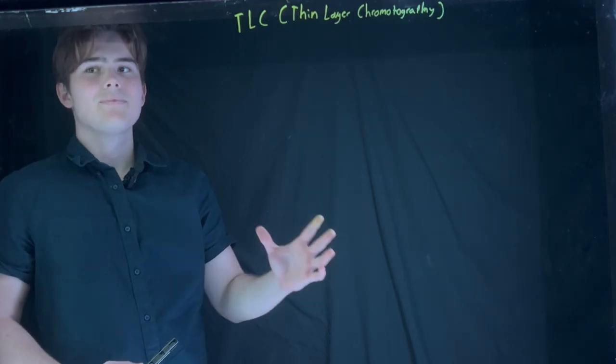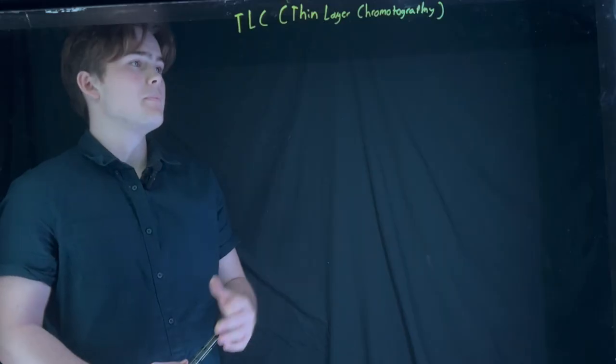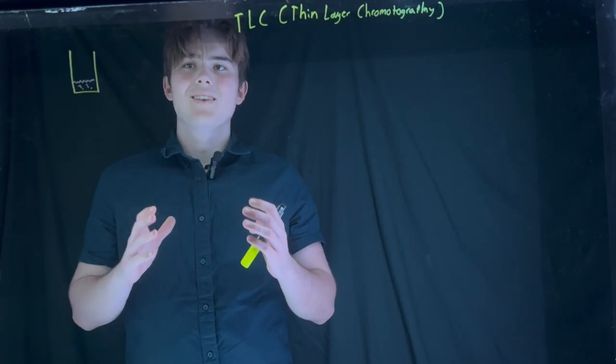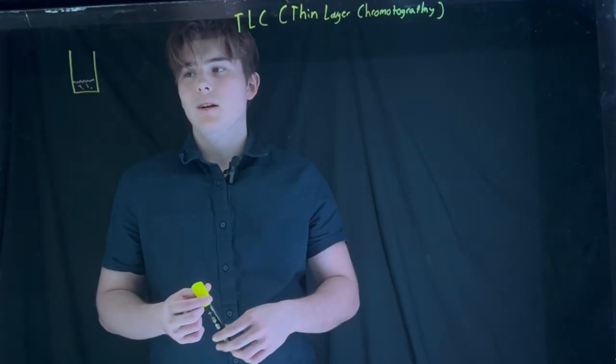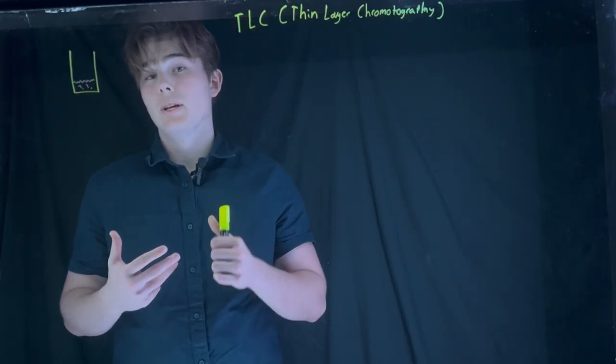Alright, hello everyone. Today we're going to be looking at TLC, or thin layer chromatography. Let's get into it. Basically, the way thin layer chromatography works is we have a substance. Specifically, we're going to be looking at amino acids.